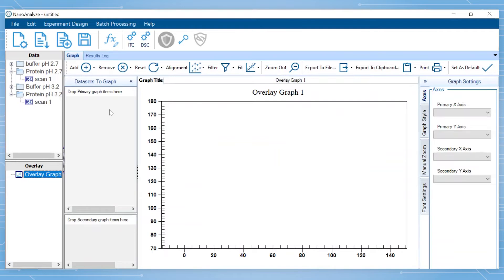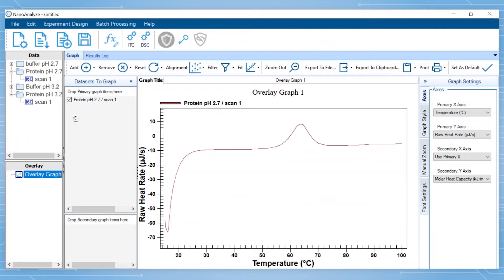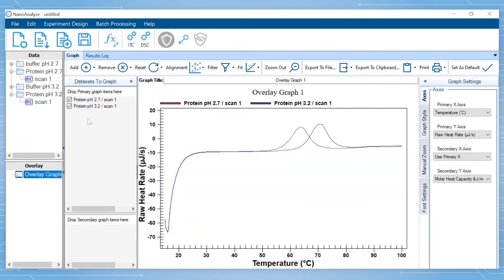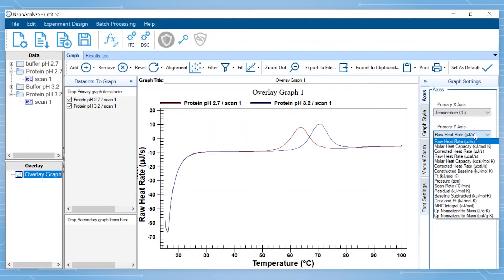From here, click and drag the files you wish to compare into the primary graph items area. Once the files are in the primary graph, you can modify the graph by using the drop-down menu to define what you wish to plot on the X and Y axis. In this case, once the data has been analyzed, we will plot temperature on the X axis and baseline subtracted on the Y axis.